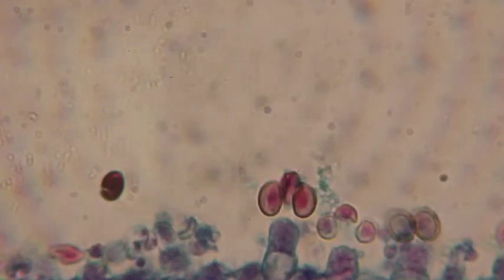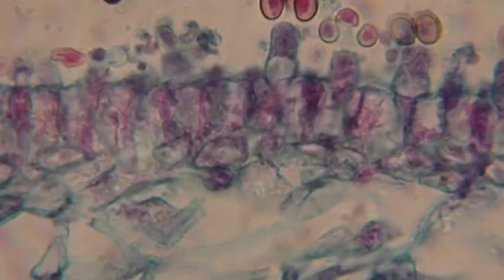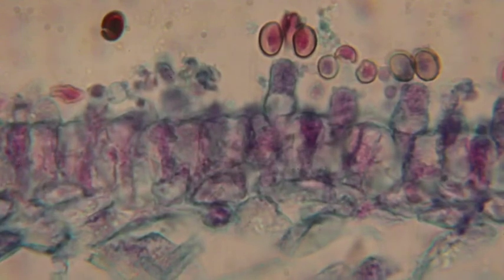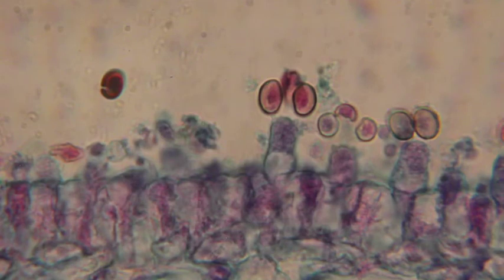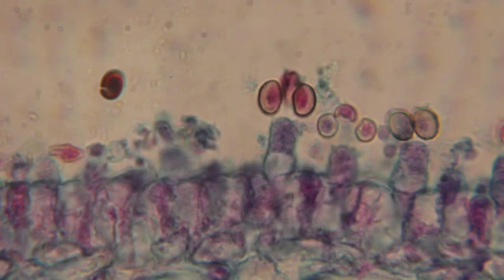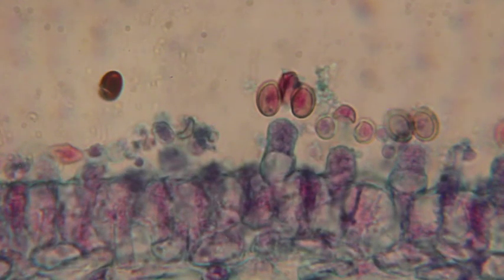We can't quite get all four spores visible. That structure that the spores are attached to is the basidium, and the spores themselves are called basidiospores. The overall mushroom is dicaryotic, and the basidium begins as a dicaryotic structure. Then karyogamy occurs and it becomes diploid. When it becomes diploid it goes through meiosis — one round of meiosis in the fungus is exactly the same as a round of meiosis in people — and that round of meiosis produces four haploid spores, which are then ready to disperse.